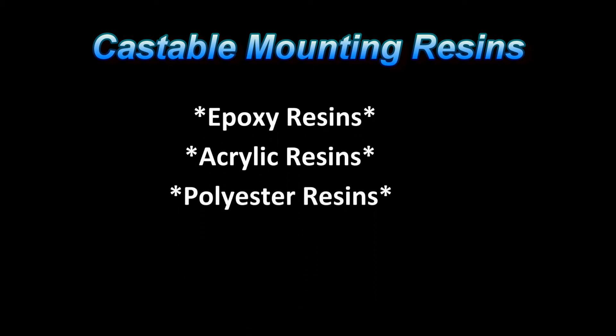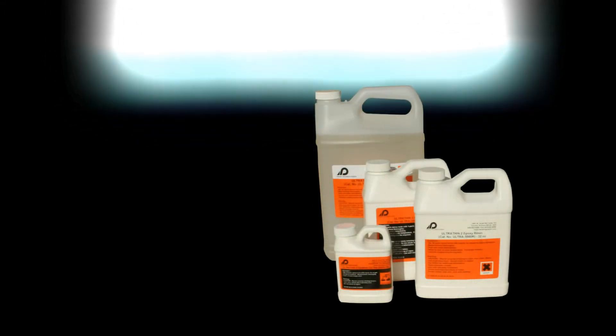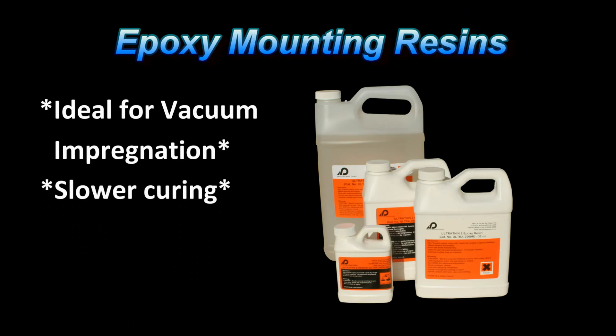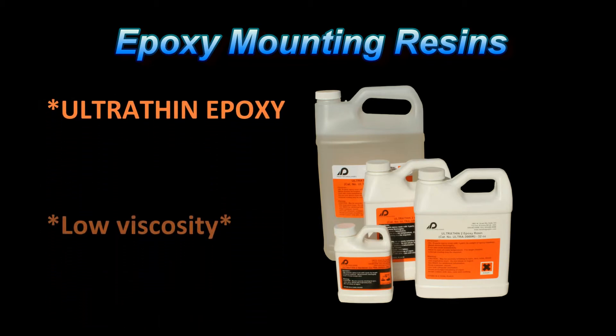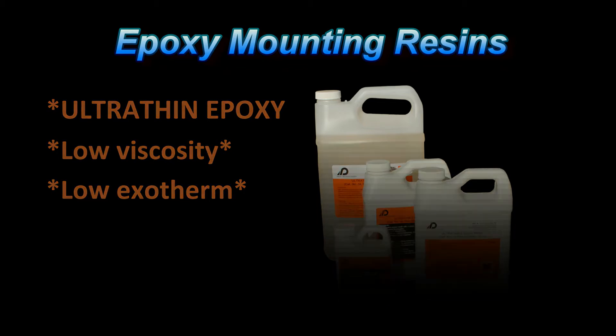There are three basic types of castable mounting resins, each having different characteristics. Epoxies are the most commonly used resins for vacuum impregnation mounting, because they take longer to cure and do not shrink as much. Pace Technologies' Premium Epoxy is an ultra-thin low-viscosity epoxy. It will penetrate better because of its lower viscosity, allowing it to flow better. Additionally, it has a relatively low exotherm, resulting in a lower curing temperature, with results of better penetration, less shrinkage, and clearer mounts.